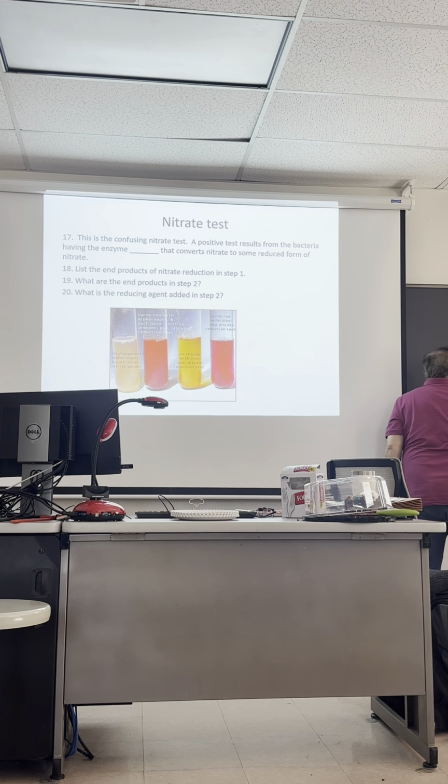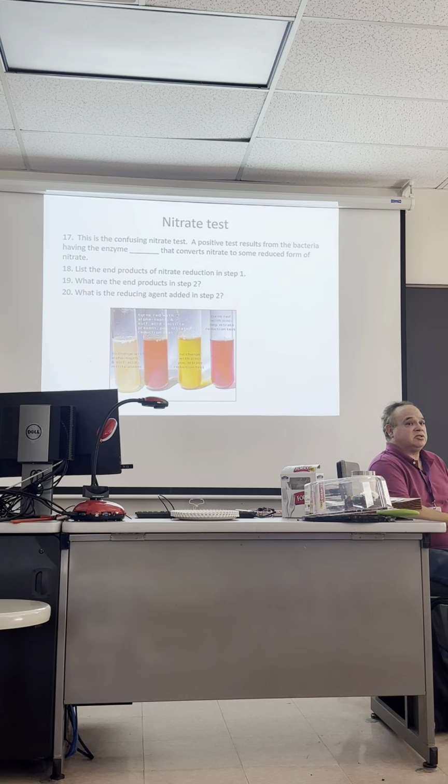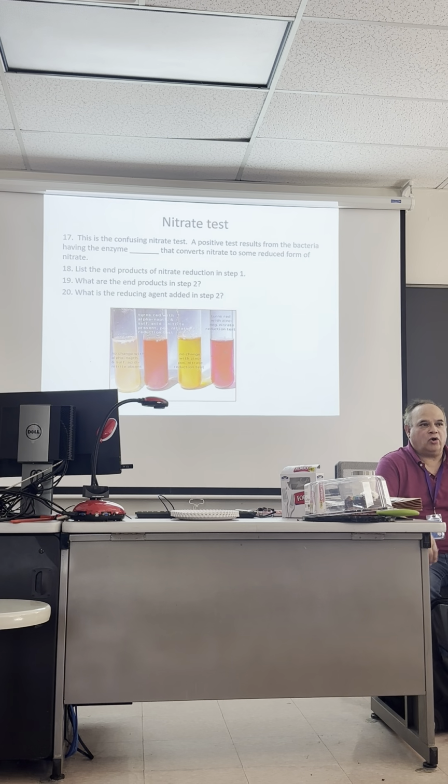Or you can write it like this, which is absolutely fair. That's exactly what that is, okay? So there's lots of ways to say it. If you get no color developed, then one of two things has happened. Either nitrate is still there in its pure form, or the nitrate has been reduced to a gas. We figure that out by adding something. What do we add? Zinc.